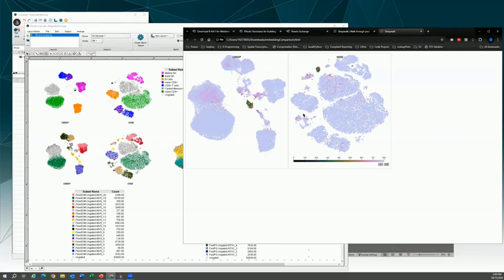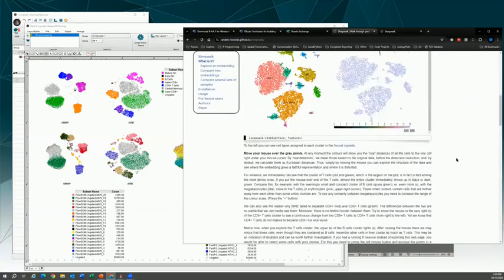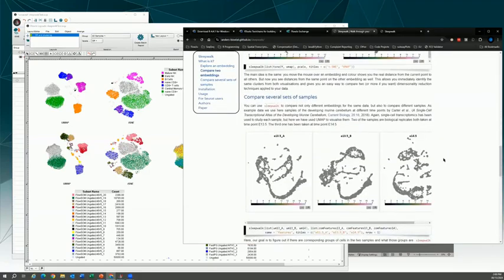But yeah, comparing the clustering with the different methods of dimensionality reduction. And then there's other cool things it can do too. Instead of just showing different methods, maybe you run the embedding on multiple different samples. I think there's an example. You can show here are 3 different samples, and you can see how those compare to one another.